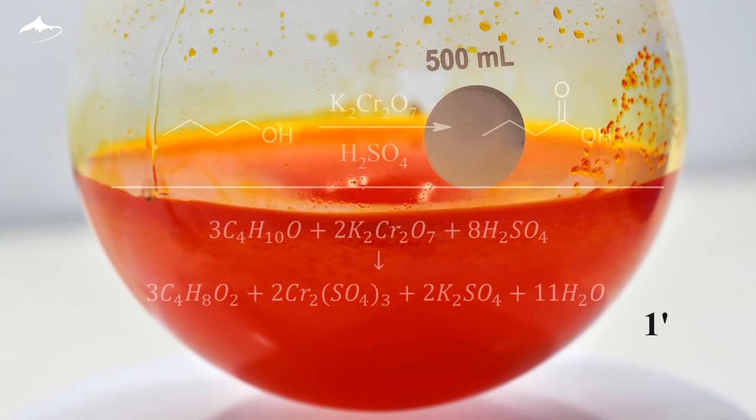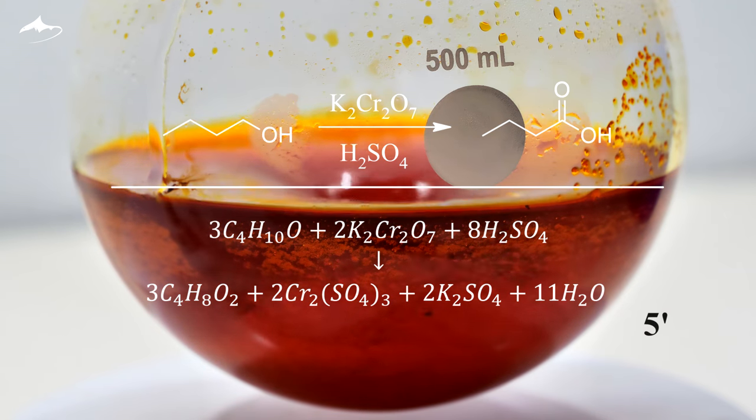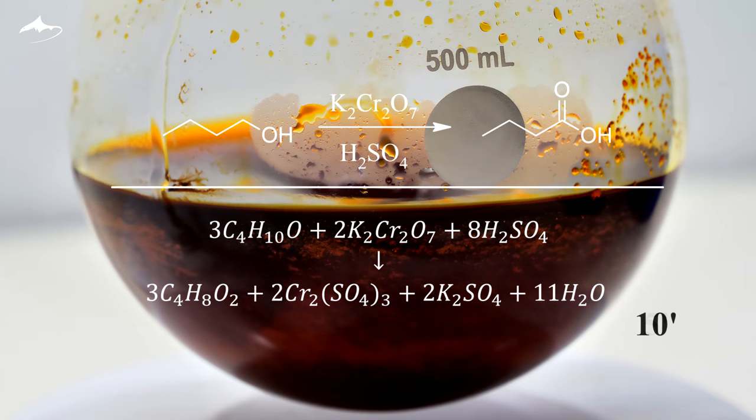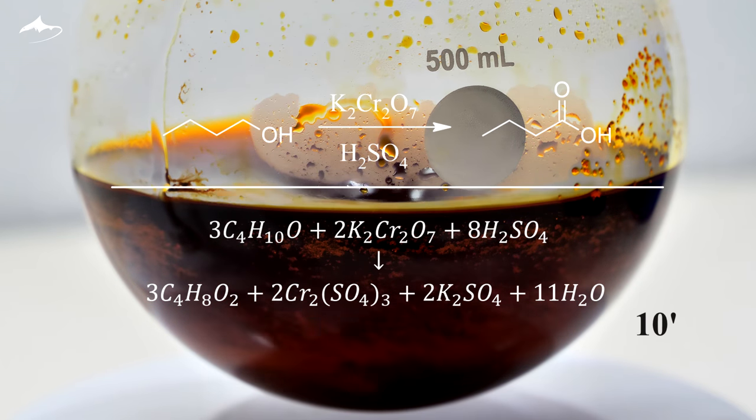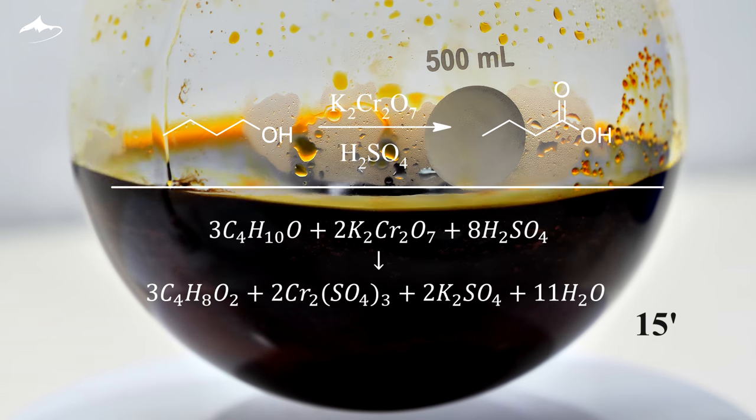Here you can see both general and stoichiometric reactions. What is happening is that hexavalent chromium, in the presence of sulfuric acid, oxidizes the primary alcohol to produce a carboxylic acid. In the process, it is reduced to trivalent chromium, which is green in solution, hence the change in color.